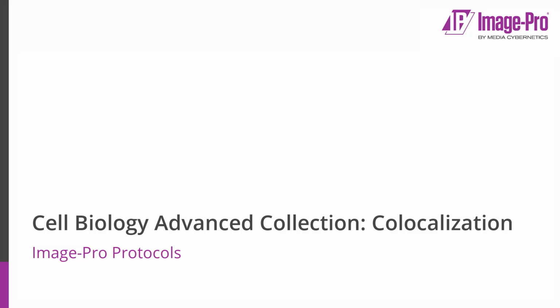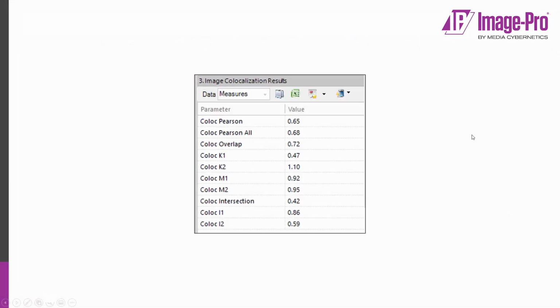In this short video, I'm going to describe how to perform colocalization analysis using ImagePro protocols. Let's start by considering the coefficients we're going to use to measure colocalization.